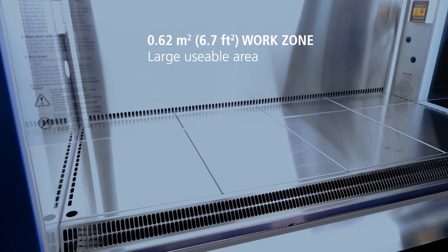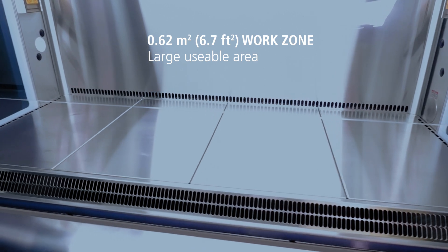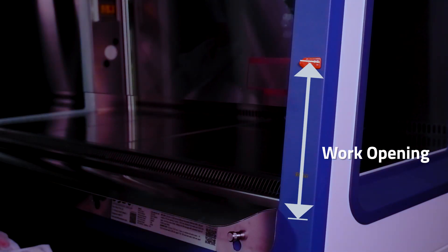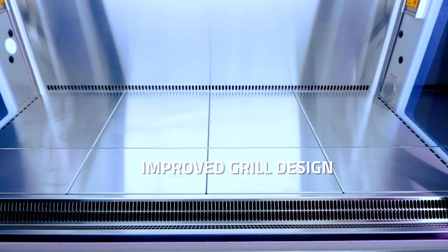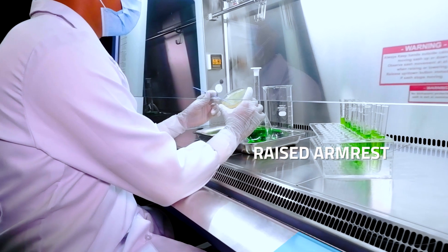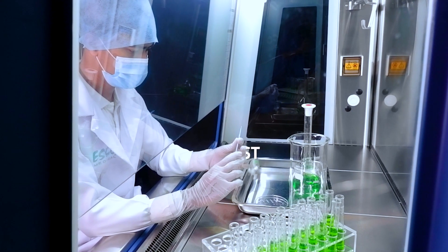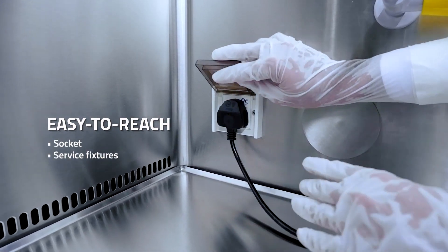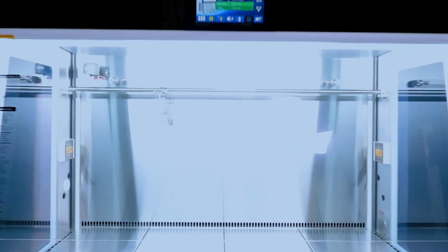The LA2EU G4 boasts a large usable area spanning 0.62 square meters. A motorized sash with ideal work opening at 200 millimeters. Enhanced in-flow grille design featuring a full-length stainless raised armrest, strategically crafted to prevent obstruction and offer ergonomic working support. Easy-to-reach socket and service fixtures — elevate your ergonomic experience with a wider range of options.